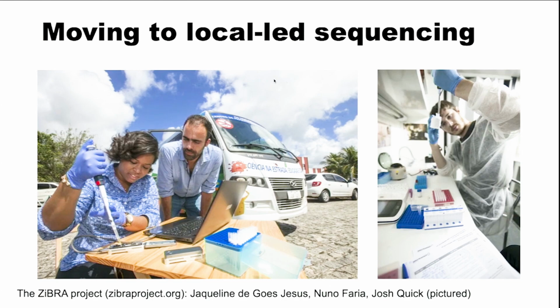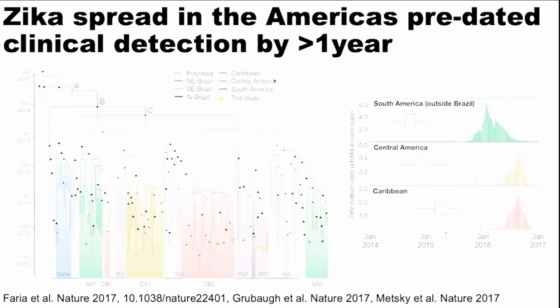All right, so just to finish up really, we use this technique, nanopore sequencing, to look at Zika as well, and rather than using fixed labs, we moved to a kind of portable lab setup. I mean, of course, none of this is as cool as doing it on the ISS, I realize, but we did think that it would be a technique that's amenable to portable sequencing, and of course it was.